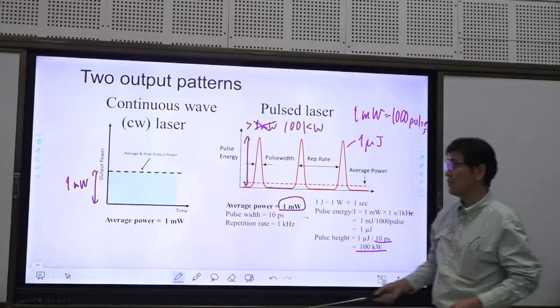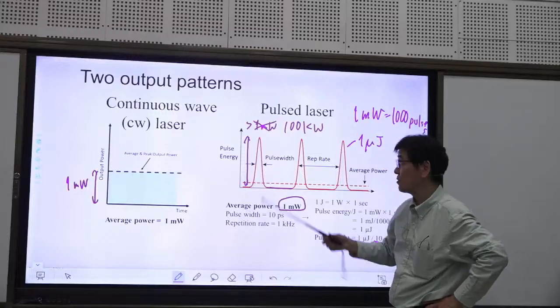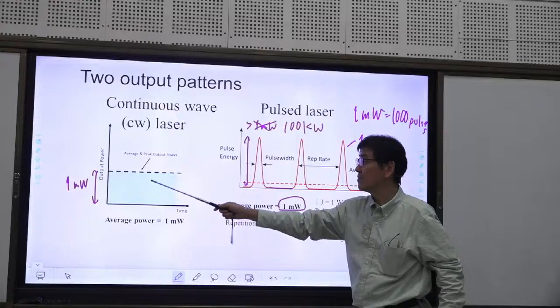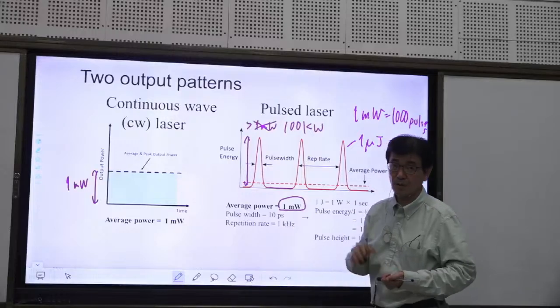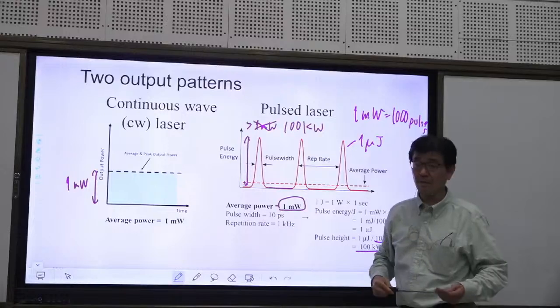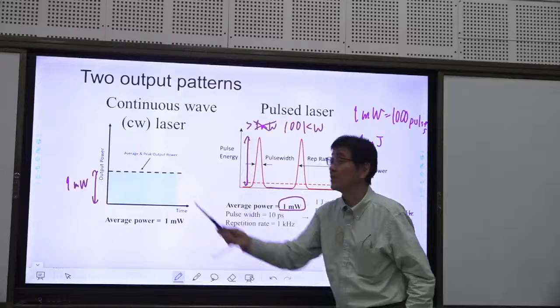So usually we choose continuous CW laser for the Raman spectroscopy because pulse laser damages the sample. And this is mild, does not damage the sample. And more importantly, this is much cheaper than pulse laser. So if the purpose is only the Raman spectroscopy, let's choose CW laser.